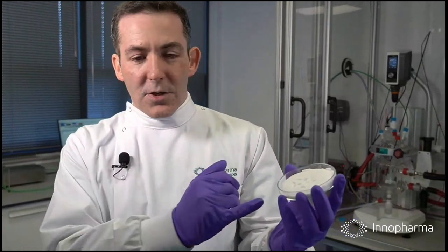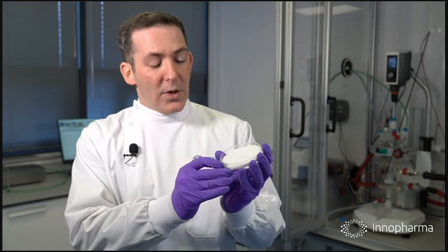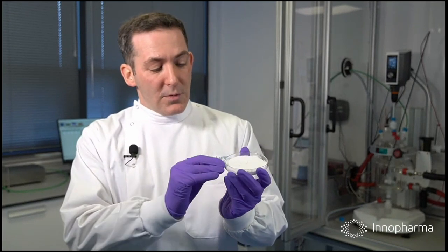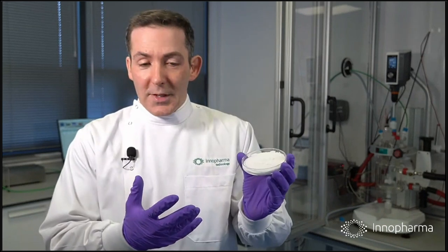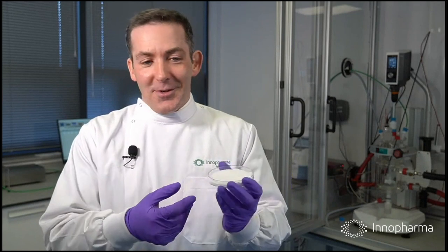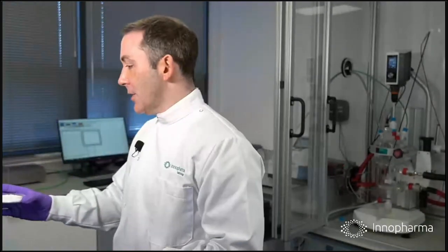So this is what we're aiming for. These are the dried crystals from the previous experiment, the one in which the model was built. And we can see that we have a very nice distribution of crystals here. It's a very uniform powder. Although I'm just saying this with the naked eye, we also saw that to be true using microscopy earlier. So we might even prepare a slide from today's experiment so that we can look at that under the microscope too, to compare the results. Oh, yes, great. Yeah, thank you.